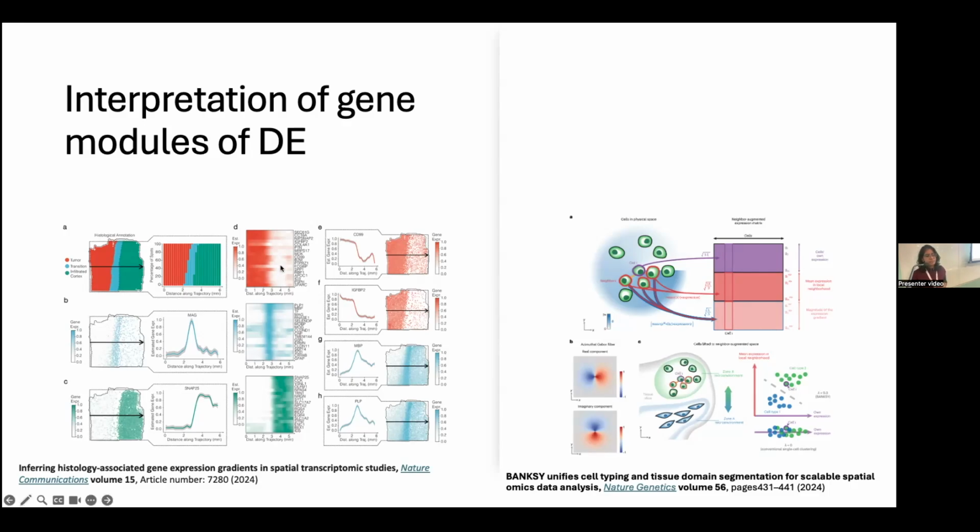But sometimes differential analysis can be just between 2 regions. So in this paper, going back to this paper here again, what they did was they were really smart. I think they had a very clearly defined question because the author is a neurosurgeon.